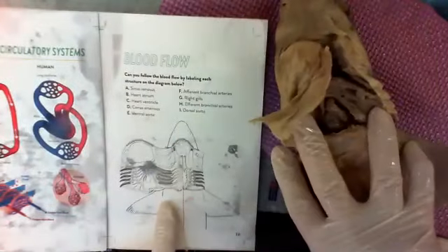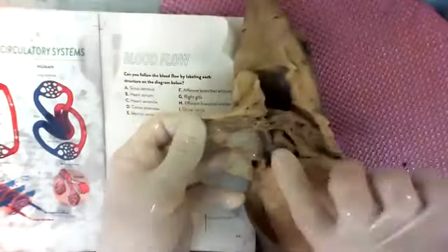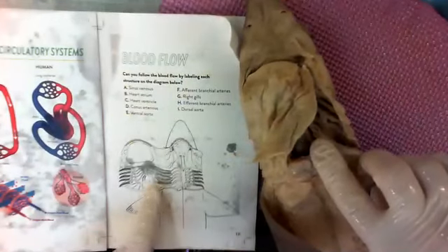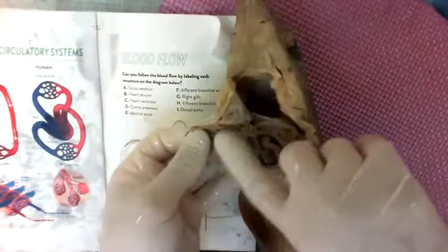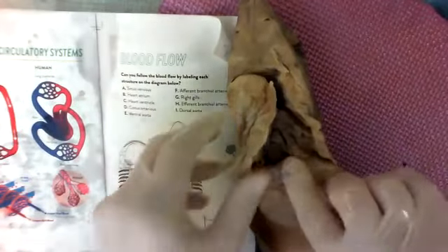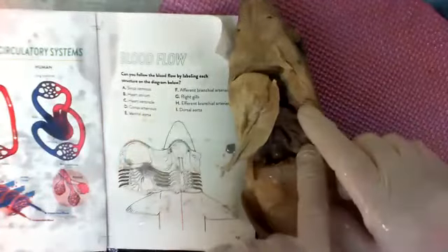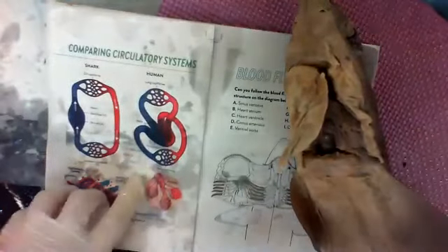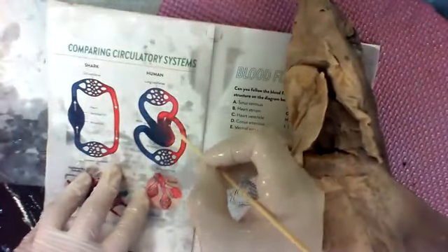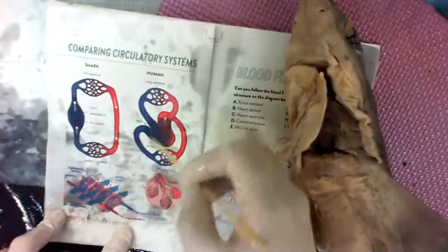Okay, so now it looks more like this. Chest open. That's the heart in the picture. It's stuck over here to the more ventral side, which means the front of the shark, where mine is still attached to the dorsal part of that cavity or that pocket. I'm flipping here because of these two pictures. So here is your circulatory system for blood, right? Here's your heart.